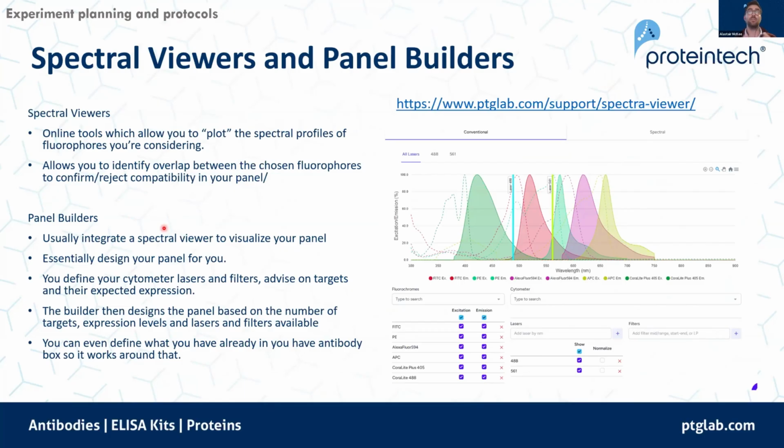But it also allows you to normalize each of those spectra to the lasers one at a time, so you can see how turning on X laser is going to affect the emission profile of those particular fluorophores. Panel builders take that a little step further. They always integrate a spectral viewer, but they allow you to build your panel based on your particular cytometer. So you would normally select the cytometer that you're using on the panel builder. And then you can even add in exactly what antibodies you already have access to.